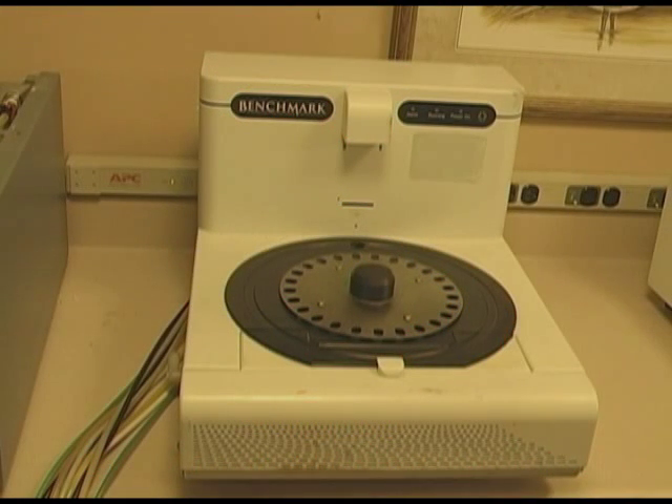Welcome back to MomEd Buddy. Today we are going to talk about the Benchmark slide stainer manufactured by Vantana.